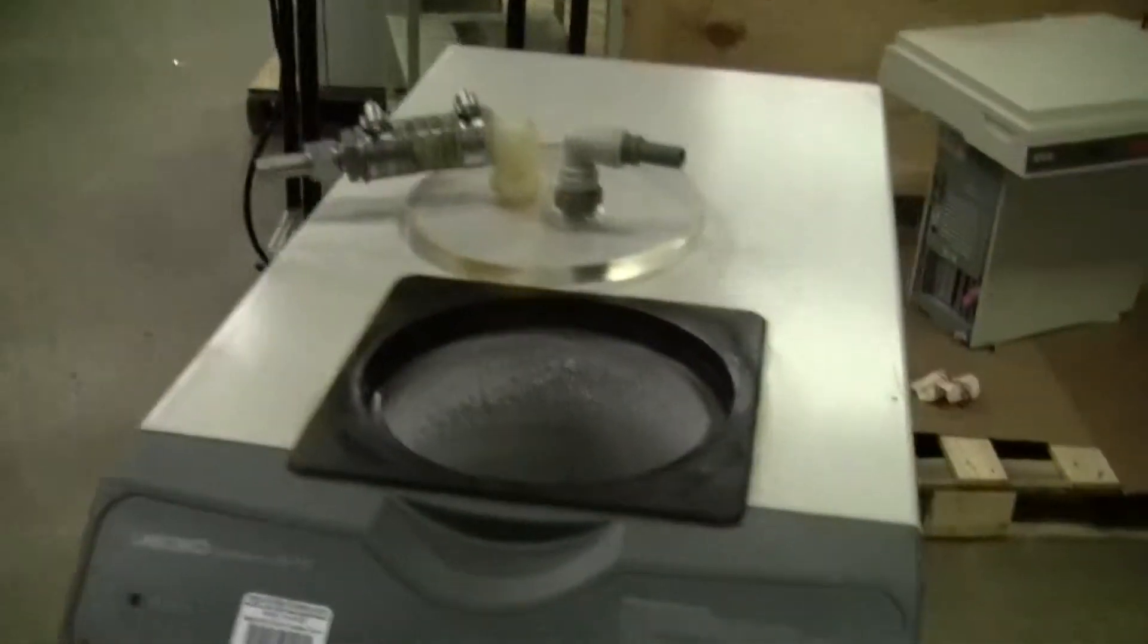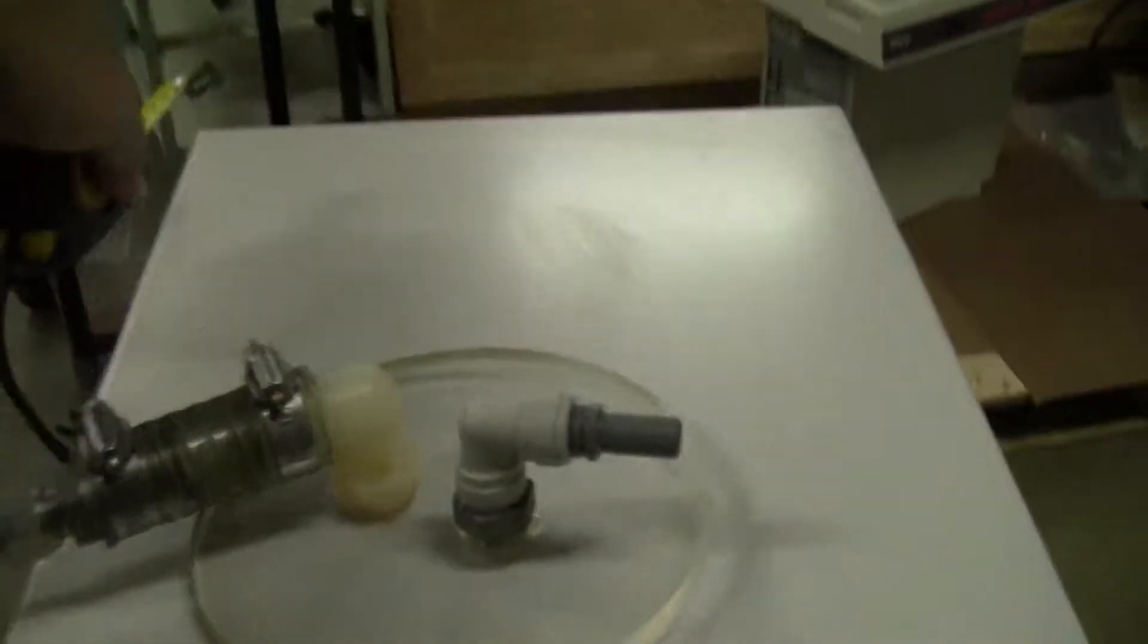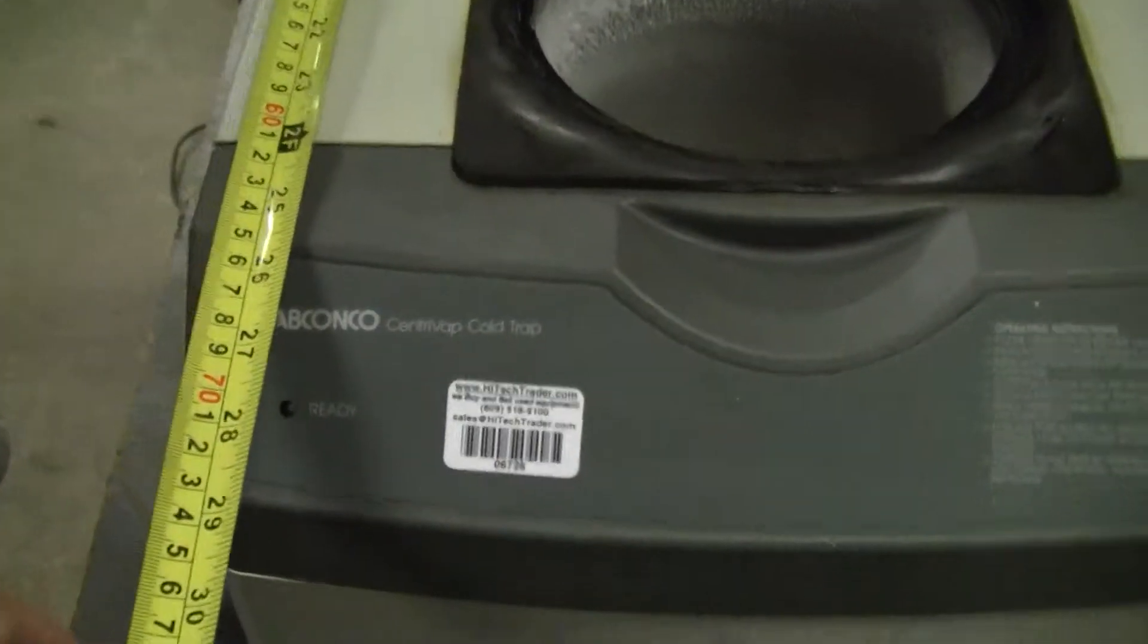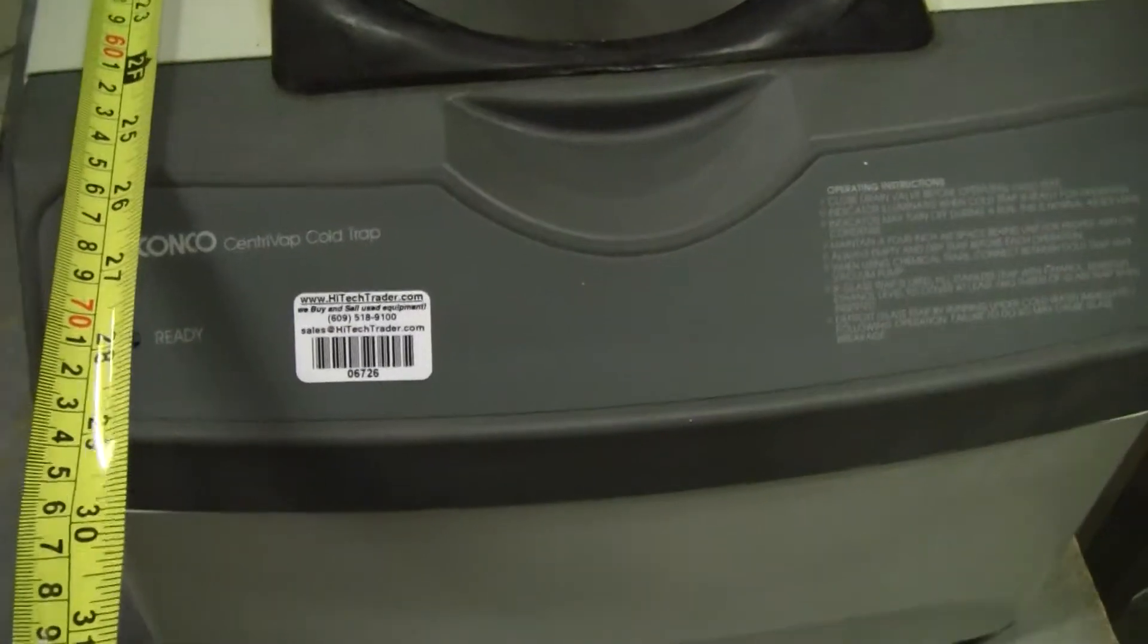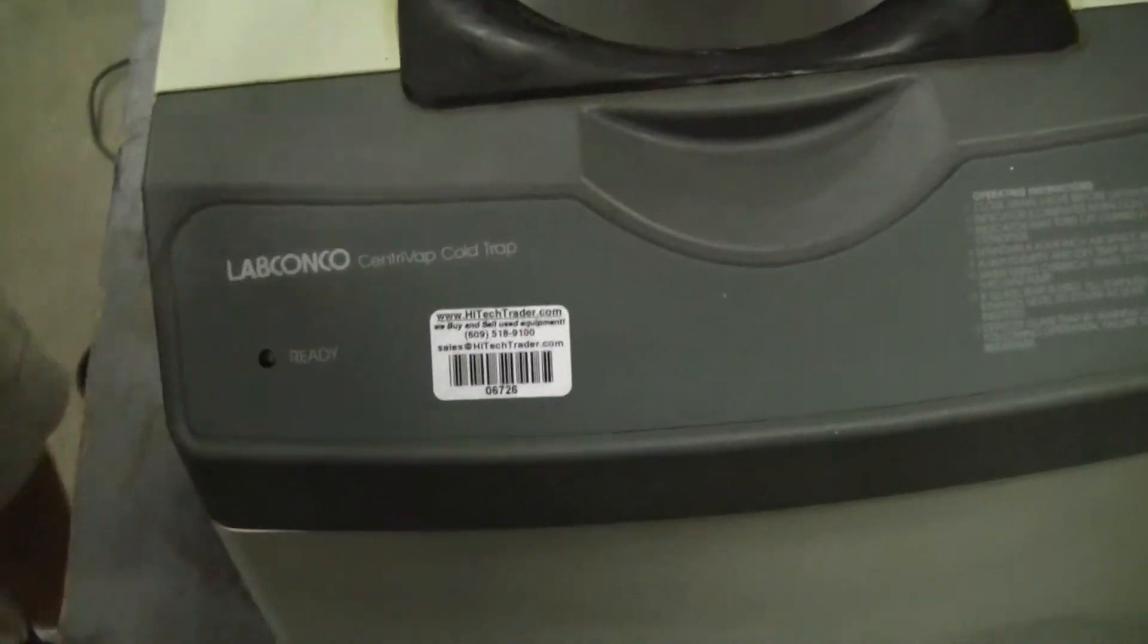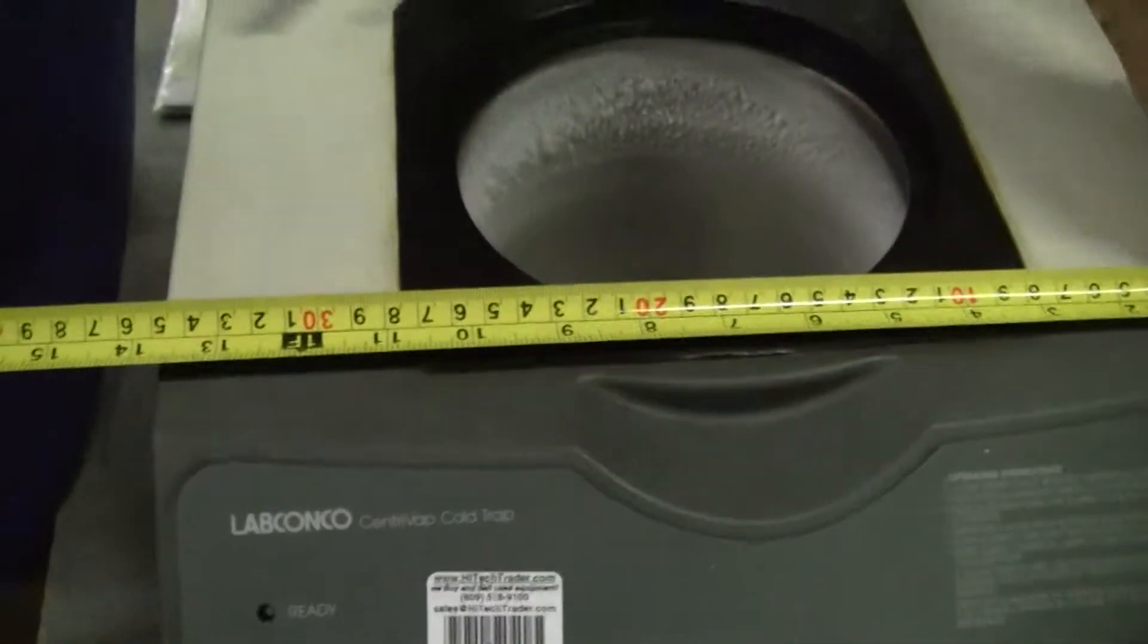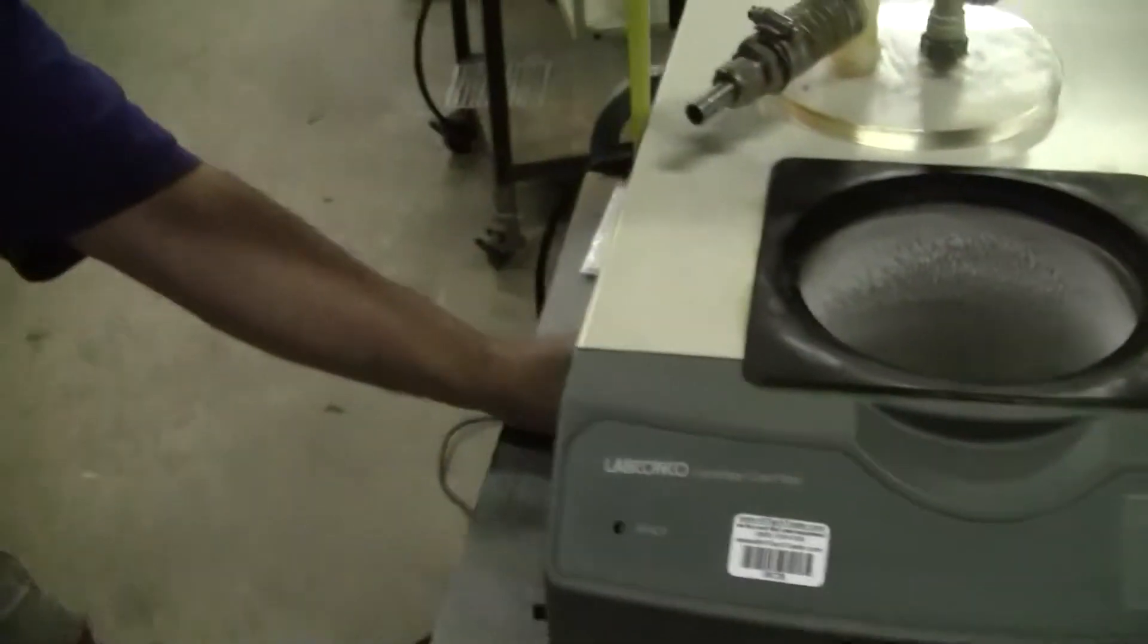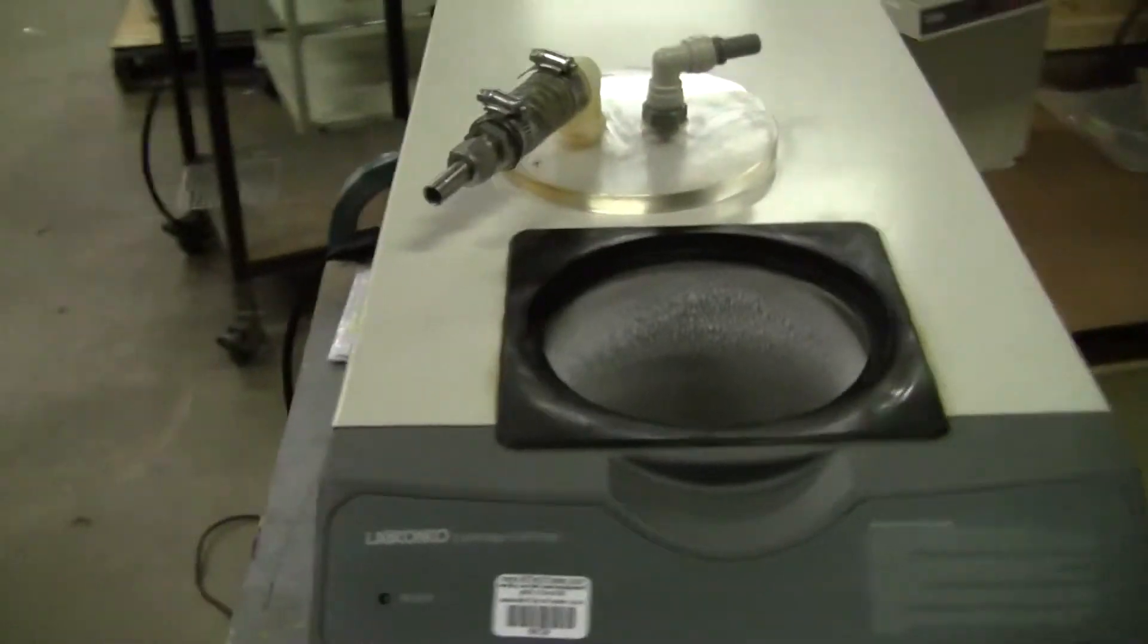Dimensionally, let's get this. Okay. Just about 29 inches for a little bit of safety. 29 by 16 by 16 in the height. You're going to go about 15, 16. Thanks, Jim.